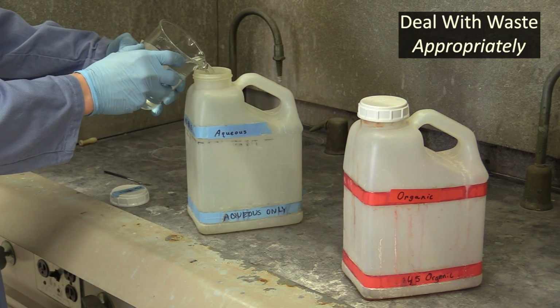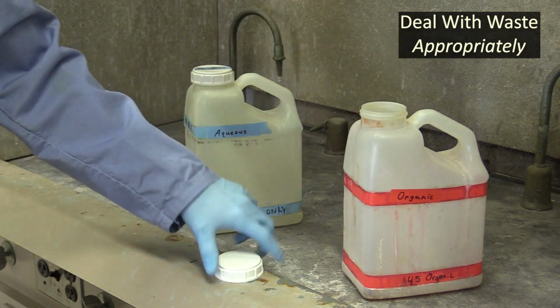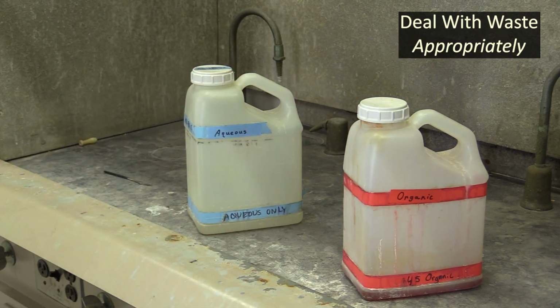When you're done with everything, make sure to dispose of your aqueous waste in the aqueous waste container and liquid organic waste in the organic waste container. Solids can go in the solid waste container.